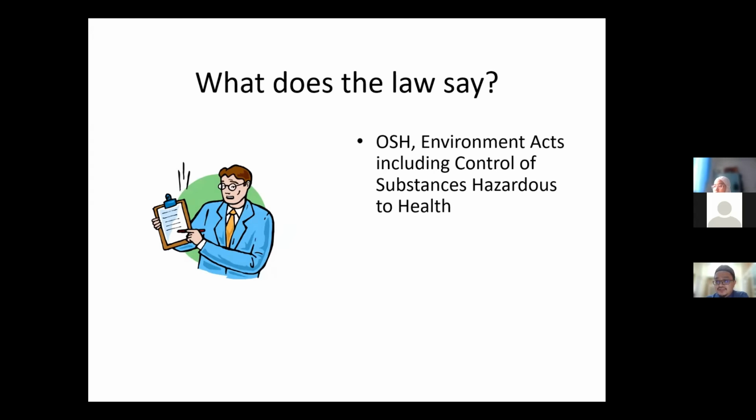Entah dia kena apa, macam elektrik ke apa ke, mati. So very sad if someone dies during working when it is supposed to be safe. So OSH, they have implemented environmental acts which include control of substances hazardous to health. And the lab must perform risk assessment.